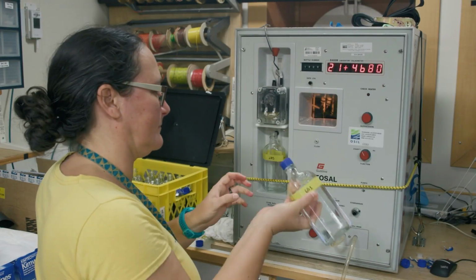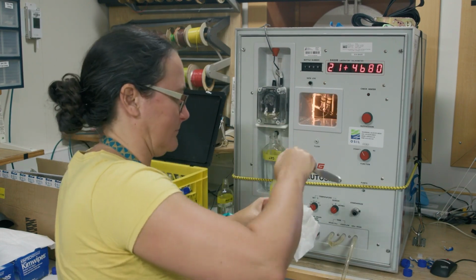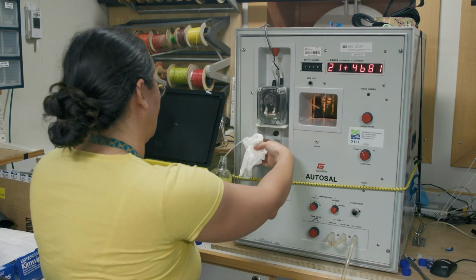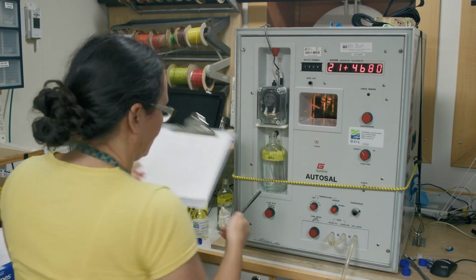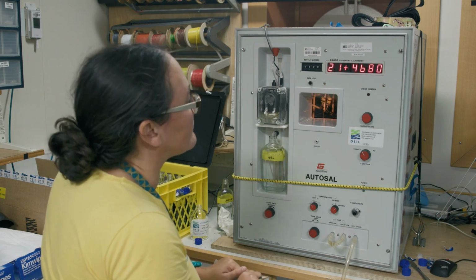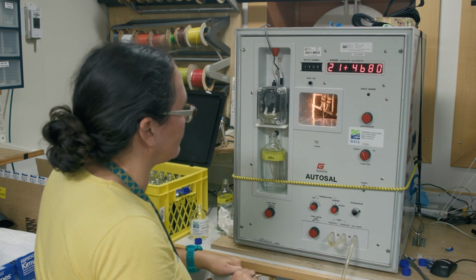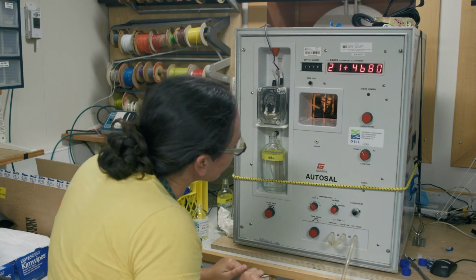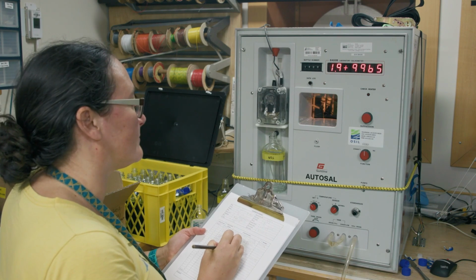Now we go on to the next sample. Take the next sample bottle, agitate it, check the seal of the insert, open, and place into the salinometer. Start the peri pump, flush, and then refill the cell. You can record the bottle label while the cell fills. Flush and fill a second time, and a third time. Switch off the peri pump, let the temperature stabilize, then switch to read. Let the display stabilize, and record the first reading.